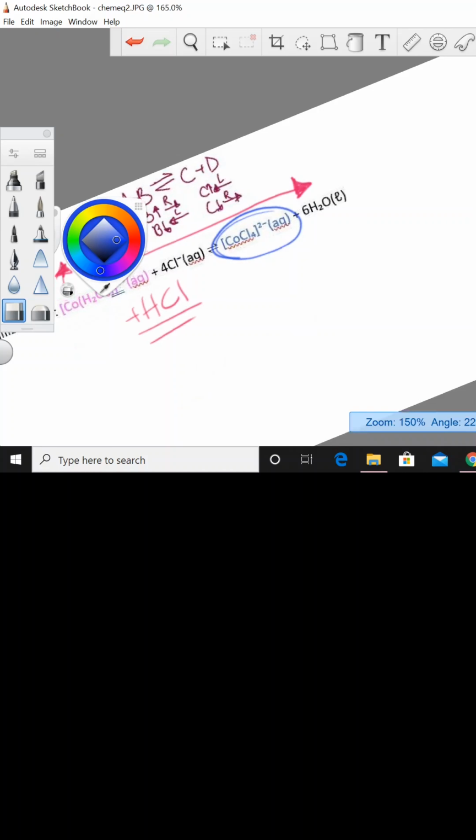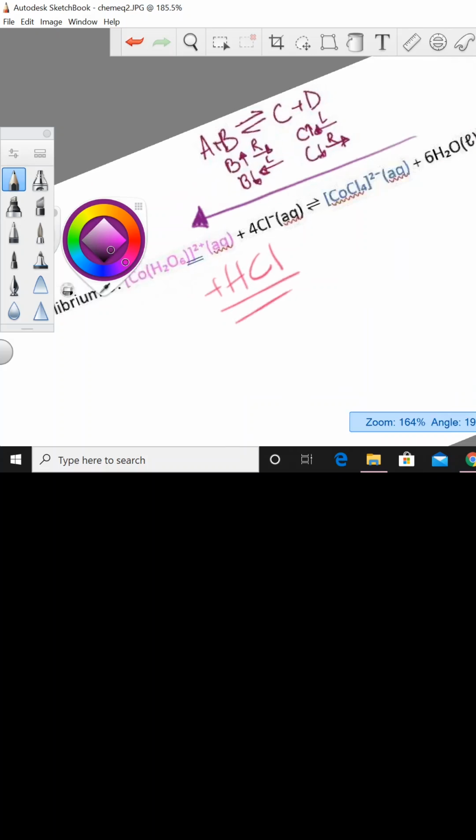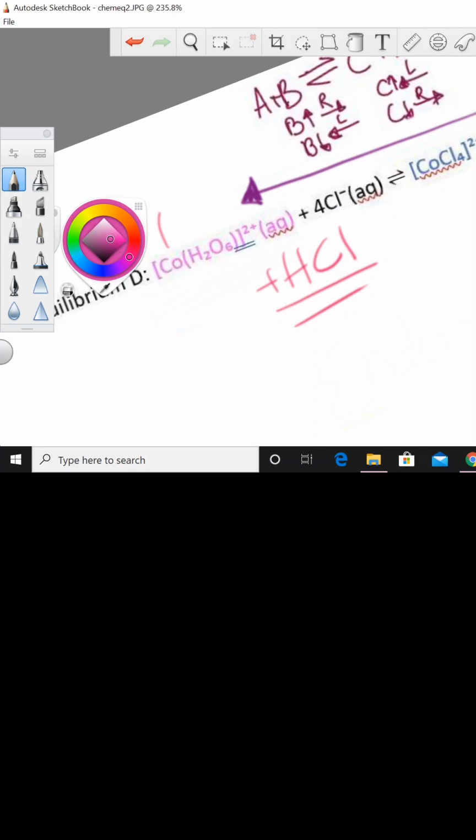Not really, but you could perhaps consider it more pink than blue than it was previously. But that would have been a left shift, because we're getting that lavender color over here. But opposite to the last one, that would make this an endothermic reaction.